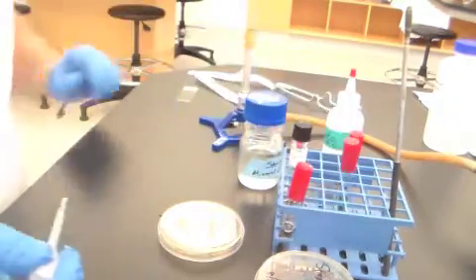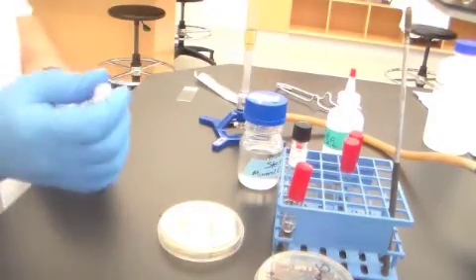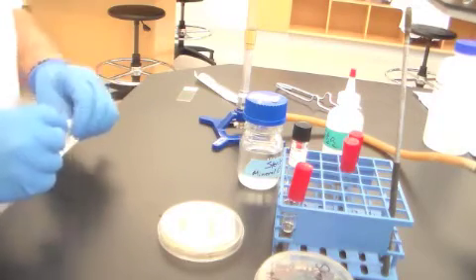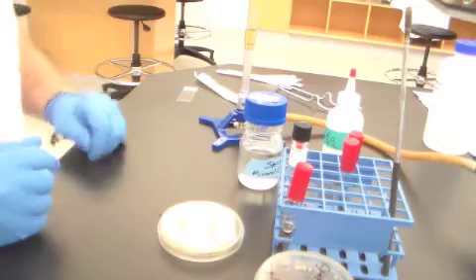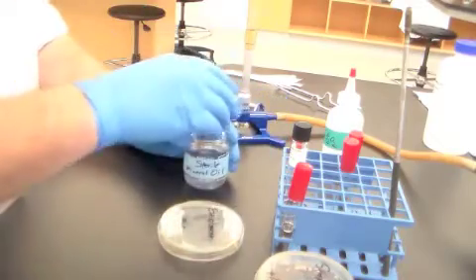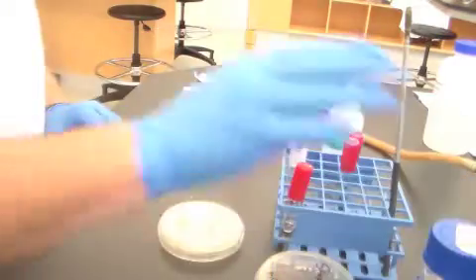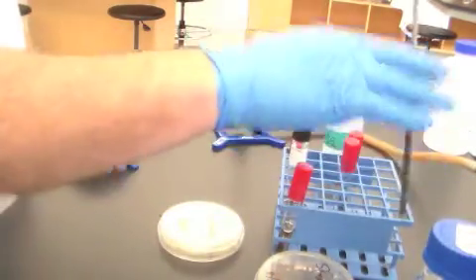These are the only 2 types of media that we do this with. None of the other media that you will inoculate, certainly today or probably any other time in microbiology lab, will you use mineral oil on top of. So that's the only trick to inoculating that.